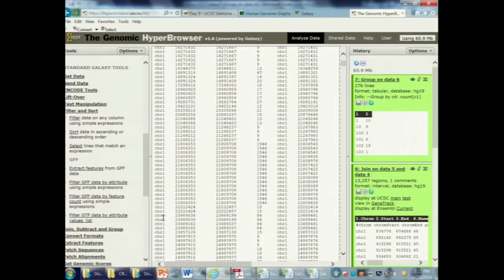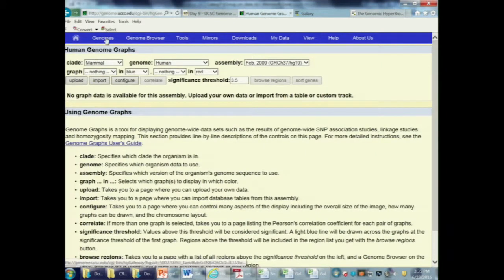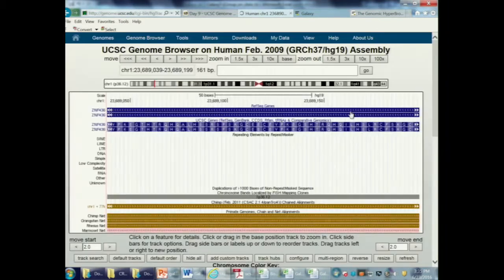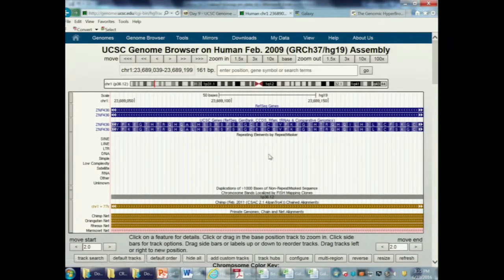Ah, here we go. So there's an 84 base pair repeat. That's the region. We can grab that, go to the human genome. We need to be in HG19. Plug that in. Let's see where it is. Okay, that's the first one. Just remember the gene name.